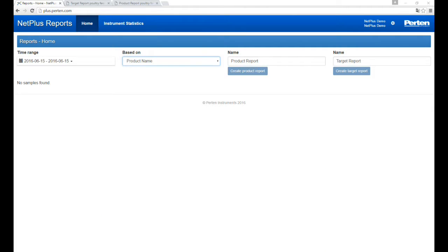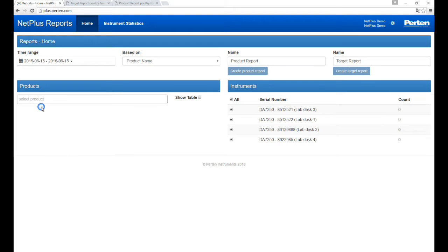In this next example, I'll select barley samples measured on several instruments, and I will start by selecting the time range. I will select the first 3 instruments where the same samples have been measured on all units. In the drop-down menu, I can select the type of profile or the product property to work with, and in this case I will select the analysis profile.